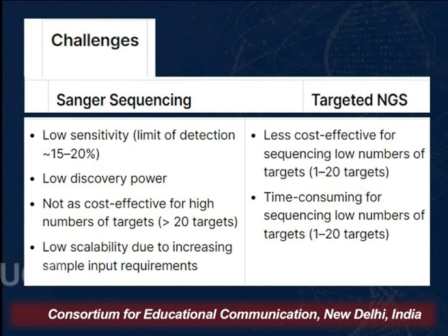For targeted NGS, the major challenge is basically the cost effectiveness of sequencing. Although, it has become very cost effective as newer and newer platforms are occurring.